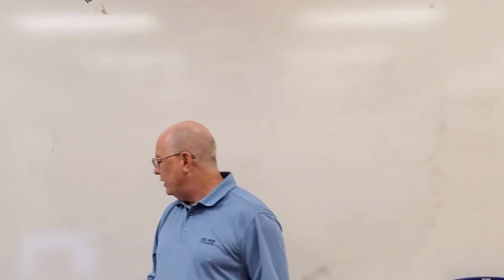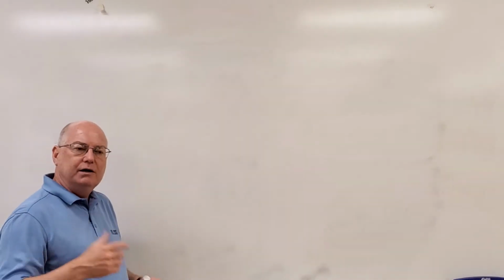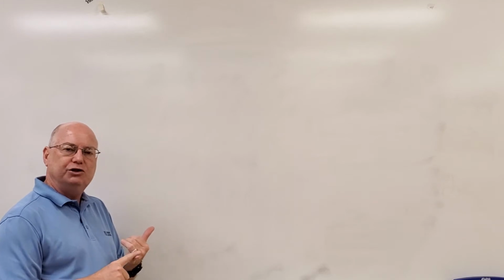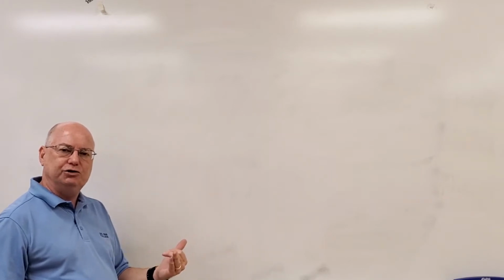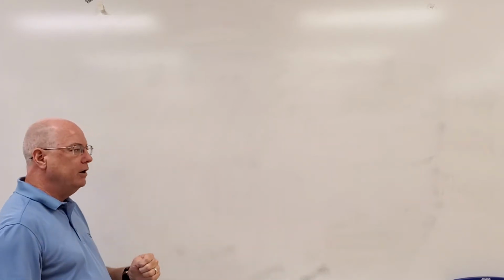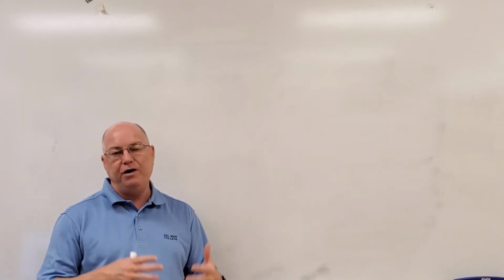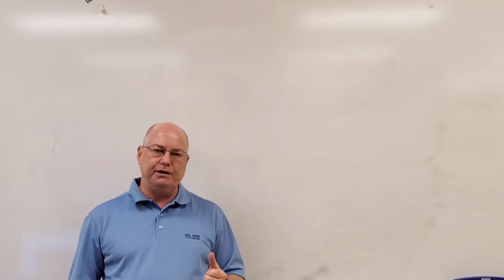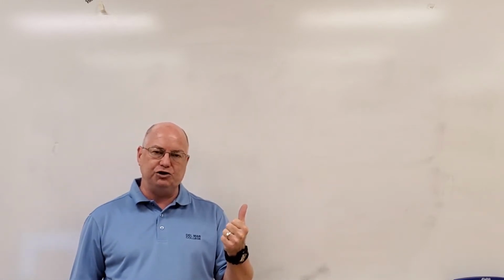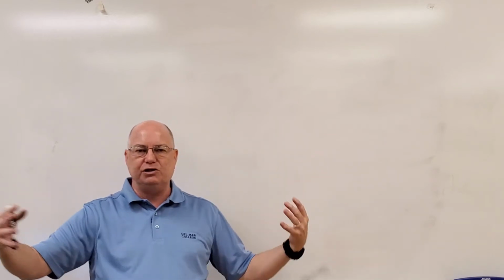So, when it comes to connective tissues, you've probably already watched the videos in lecture for the beginnings of tissues and how we name epithelial tissues. You've watched the laboratory video on epithelial tissues. There's only 4 slides to look at. Connective tissues are probably one of the more varied of all the tissue types. What makes one connective tissue different from the other is the type of cells found in the tissue and what makes up the matrix, all the parts that are in between the cells.